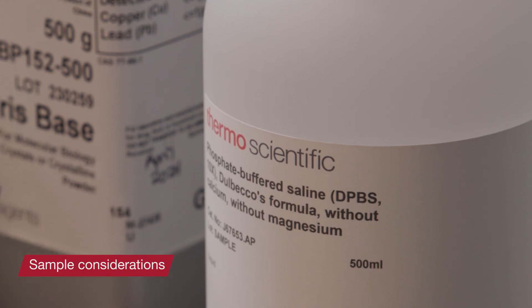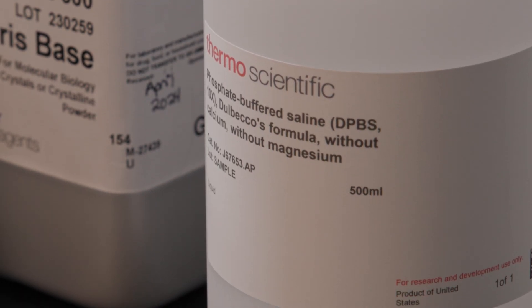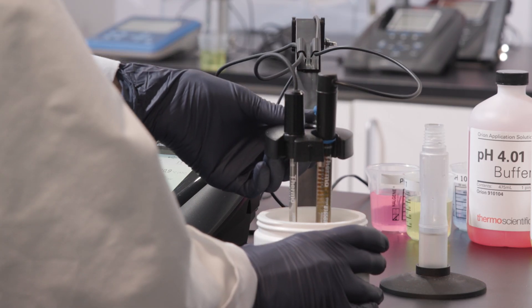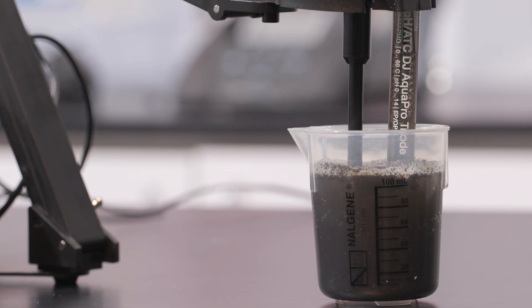Let's begin by discussing sample considerations. Different samples require different electrodes. When samples have certain chemical properties, lack water content, have high or low ionic strength, particulates, or are viscous, you need an electrode that can accommodate that sample type.